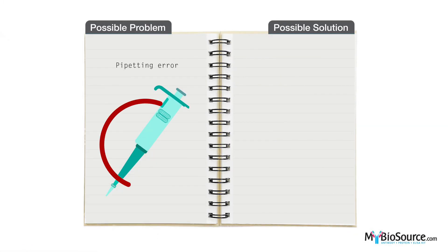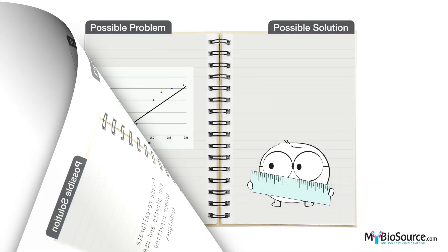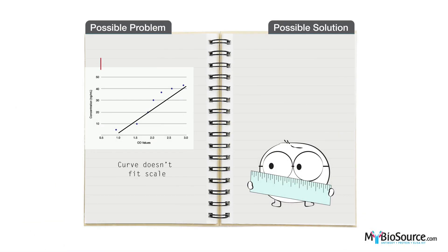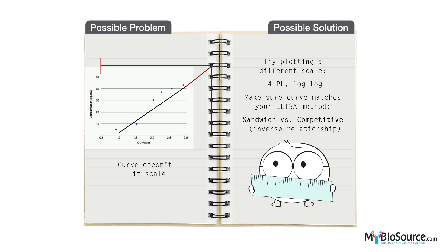There may also be pipetting errors leading to a poor standard curve. Please recalibrate your pipette and use proper pipetting techniques for ELISA assays. In some cases the curve you are using may not fit to scale; therefore you may want to try plotting a different scale that matches your ELISA method, such as a four parameter logistic curve.